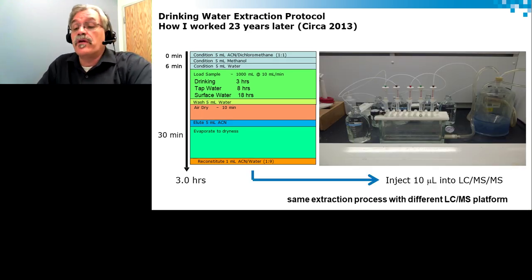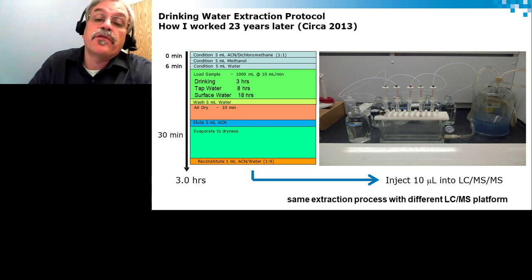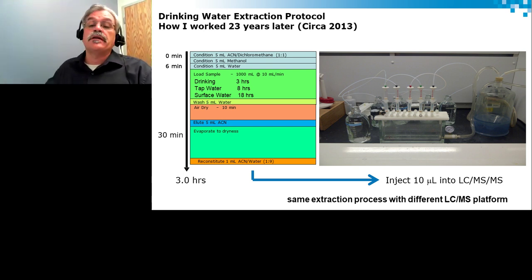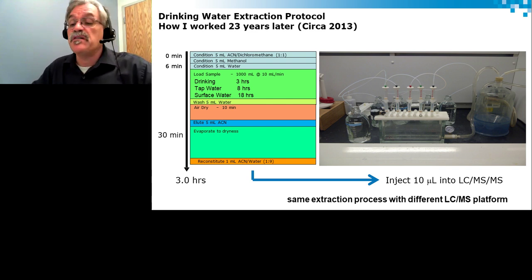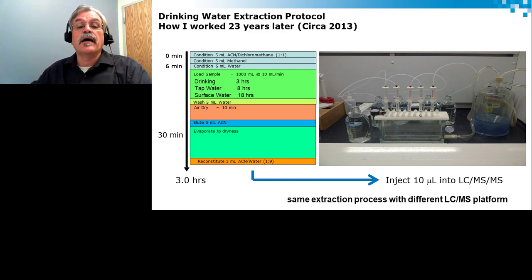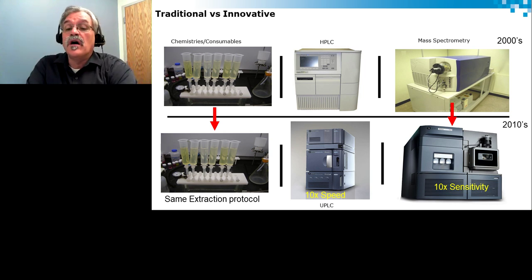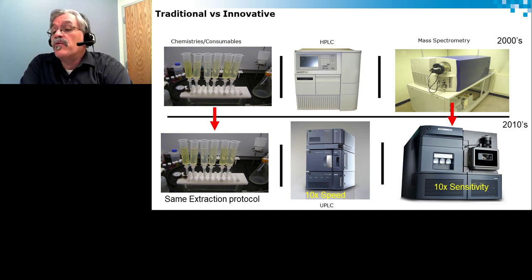Funny, interesting is that 23 years later, as a savvy user in chemistry, I'm still using the same protocol. Technology has changed, mass spectrometry increased in sensitivity, chromatography increased in speed, but the sample prep remained the same. That's actually where you start realizing that when we look at instrumentation, for example, in the next slides, you'll see that traditional versus innovative. You will see that on the upper hand, that's how I was introduced back in 2000 when LCMS came to the market.